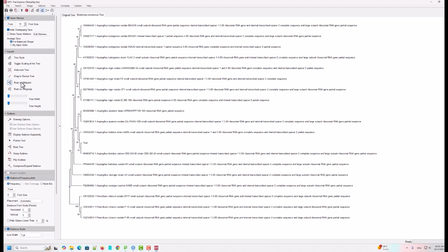Here you can see the file menu. In the file menu, definitely like other software, it will give you options to import, export, and these types of options. In the search menu, you can find a specific taxa, like a specific name for the fungi. Yes, here in this tree is the fungi. This is called taxa. This is taxa. So you can search directly here.